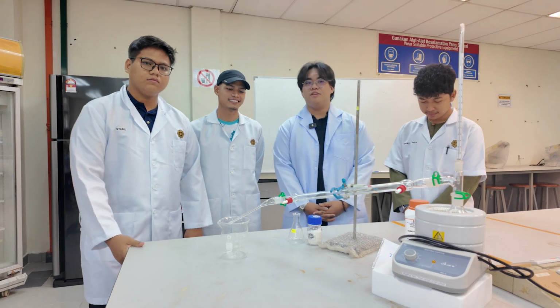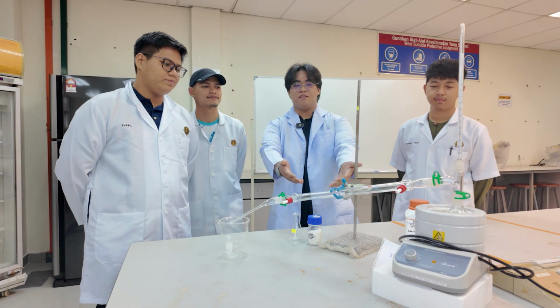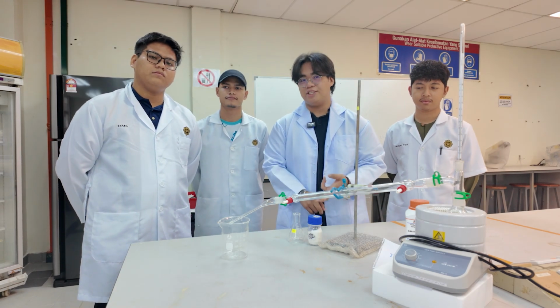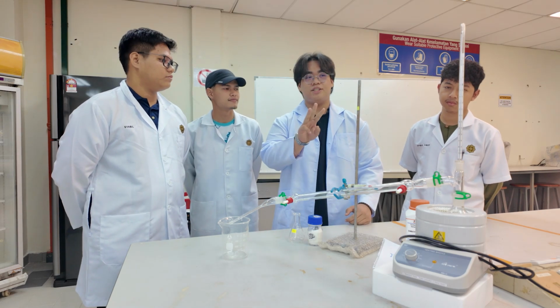Bismillahirrahmanirrahim. Assalamualaikum warahmatullahi wabarakatuh. So today we are going to be presenting about the distillation process from experiment 1 and 2, that is extraction and purification of organic compound. Okay, so as we all know, we have 3 separation techniques.